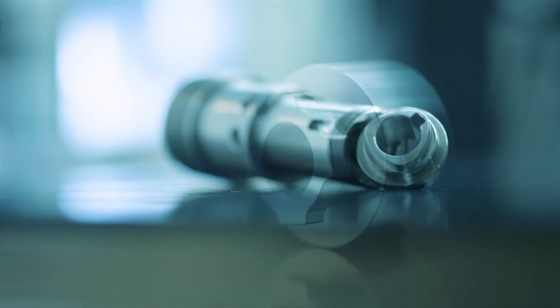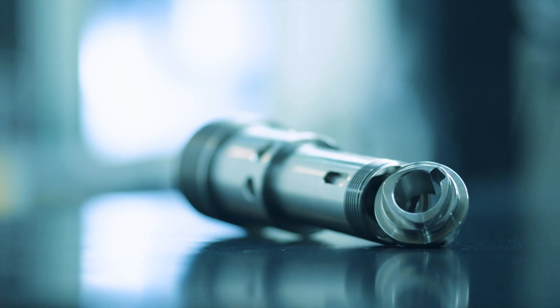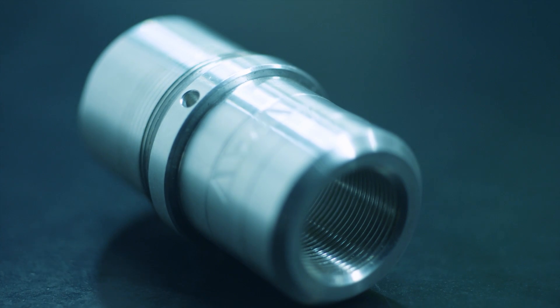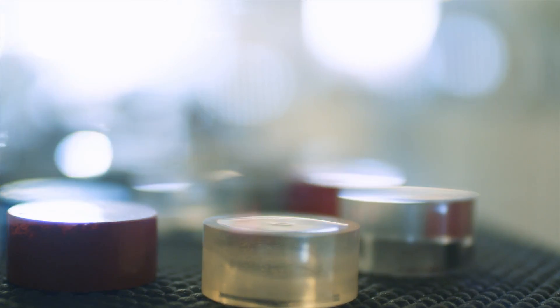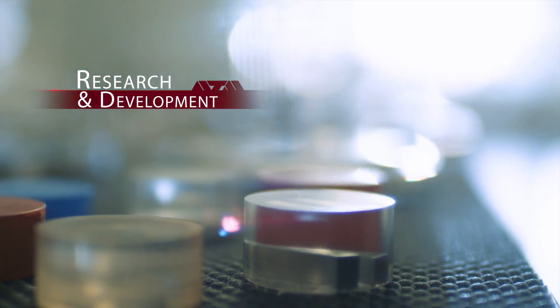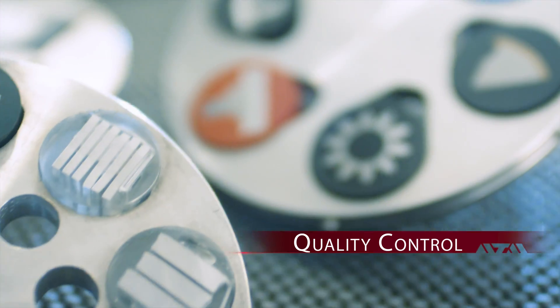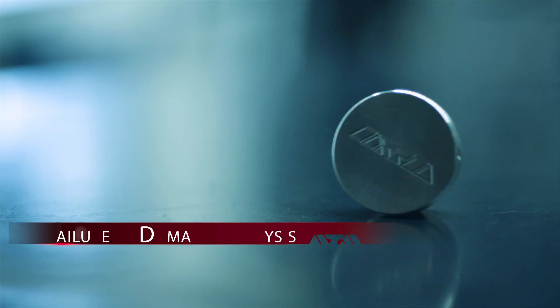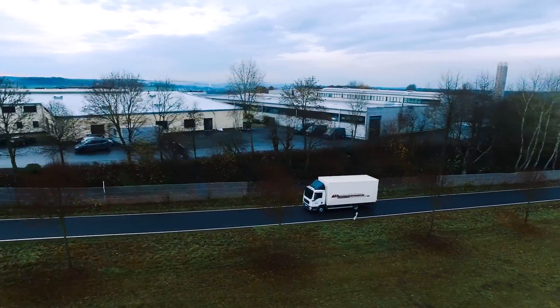To understand quality, you need to pay attention to details. Details which may be hidden from view. ATM uncovers the hidden with groundbreaking machines and products for materialographic sample preparation and analysis as part of the quality control process.